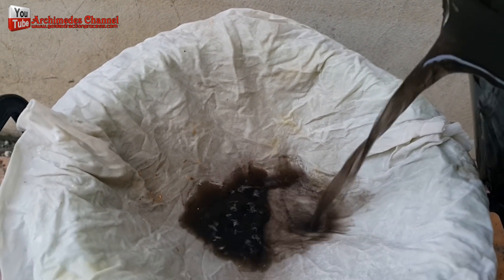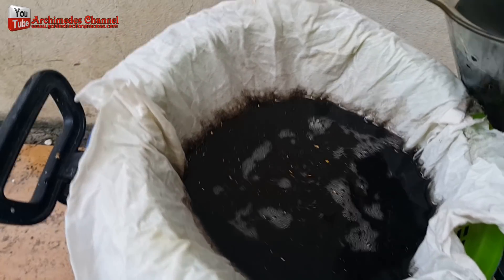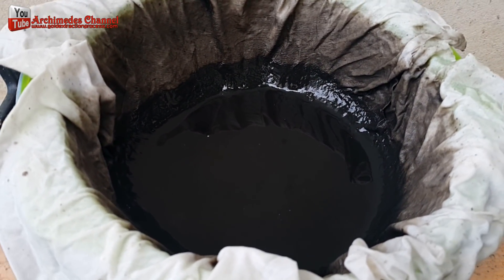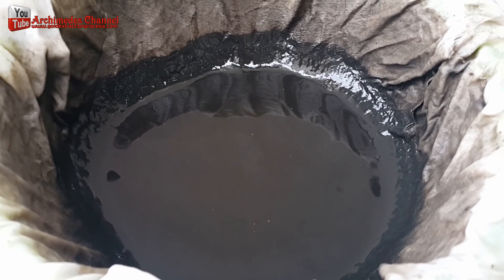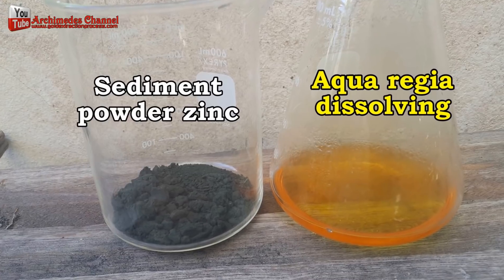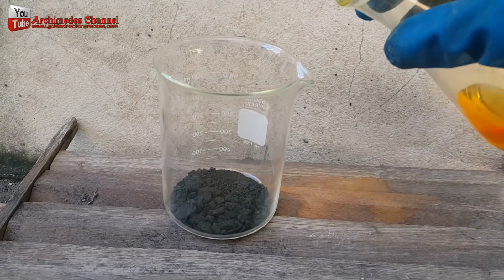I used a piece of cloth to sift the gold sediment, then I rinsed it with hot water. The cloth used to sift through the gold sediment can now be burned. The gold sediment could either be made into aqua regia, or the sediment could be sorted out and blown dry. I used the gold sediment to make aqua regia.